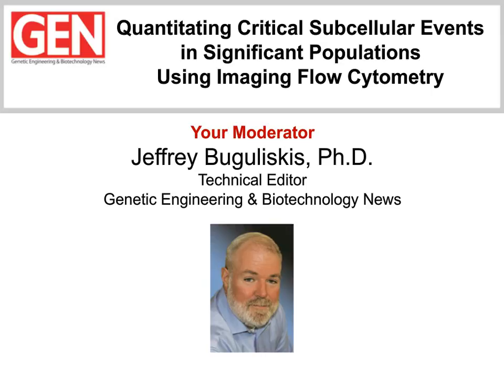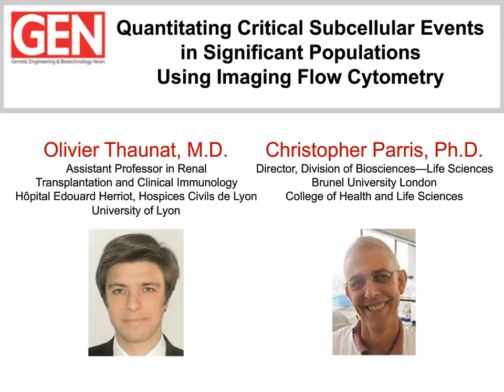With the aid of imaging flow cytometry, scientists can now begin to answer critical questions concerning the subcellular distribution of various molecules within cells that are critical for disease states. Let's meet our panelists for this GEN webinar, who will discuss their novel approaches for utilizing imaging flow cytometry to tackle the underlying mechanisms of immunology and cancer biology.